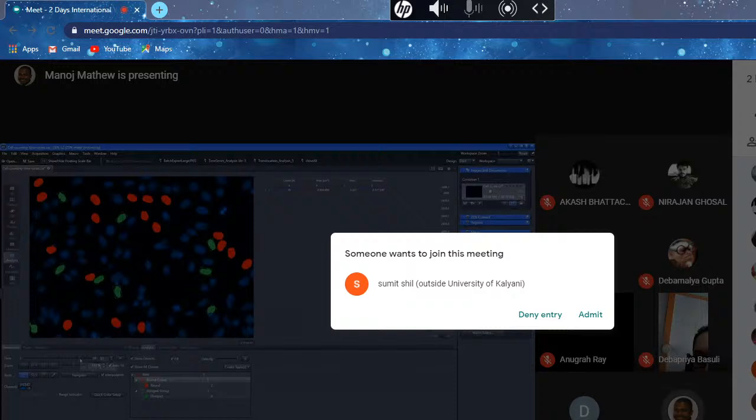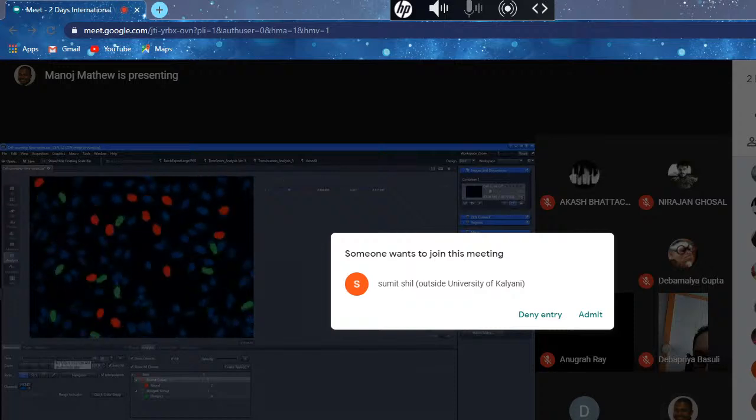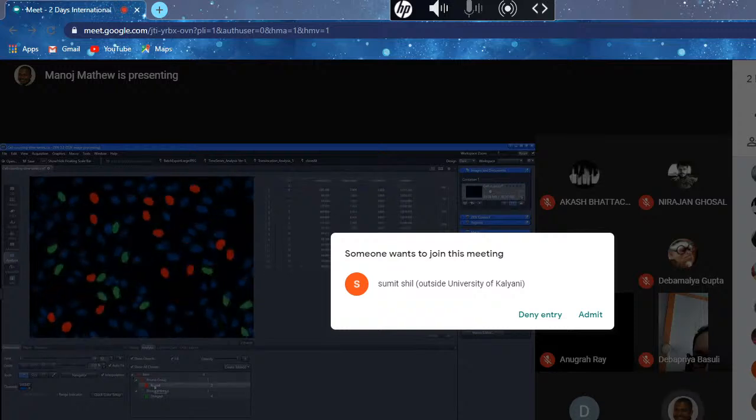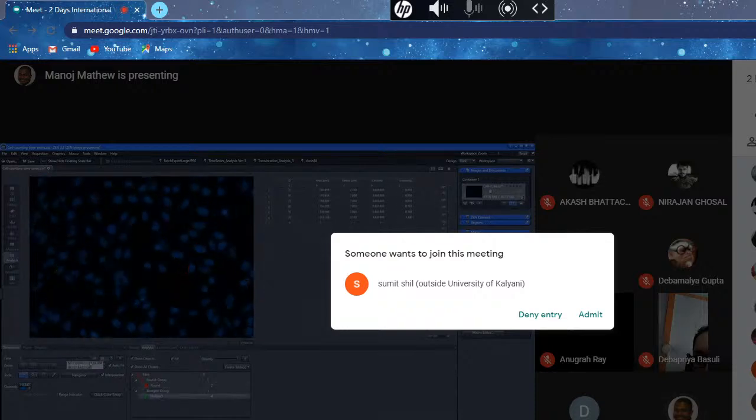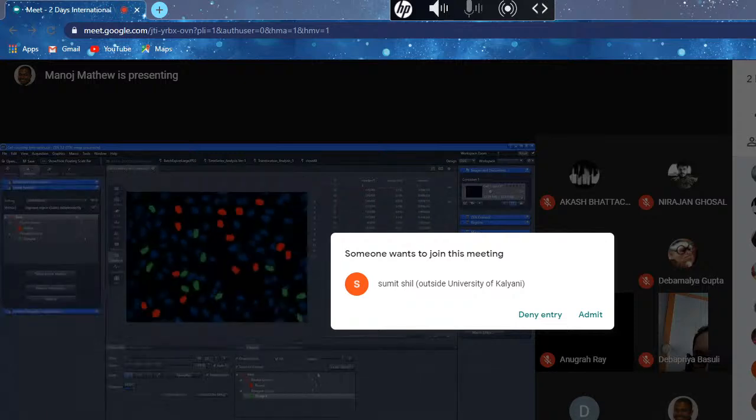And if I move this, you see this information, the group information for every frame, is available here. And if I want individual information, this is information for every detected object in that frame. And this is what the measurement does. So this was a quick overview of image analysis, or creating a workflow for image analysis.